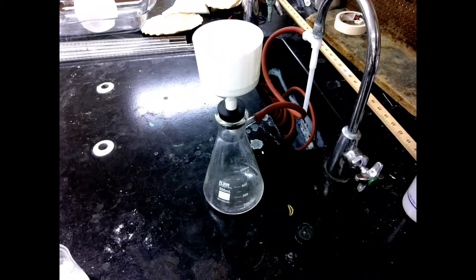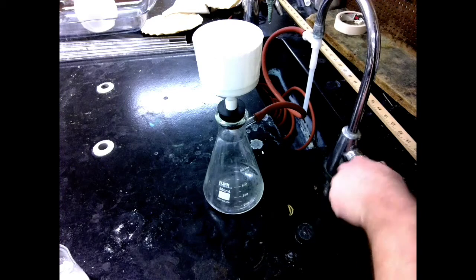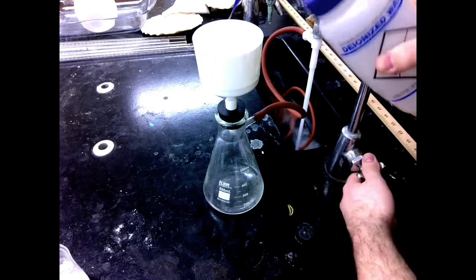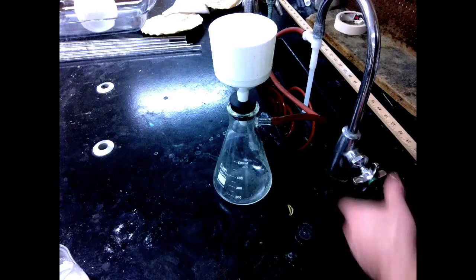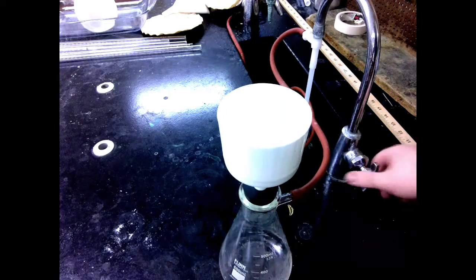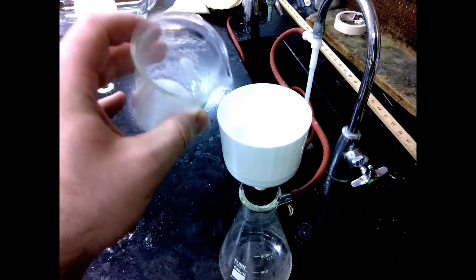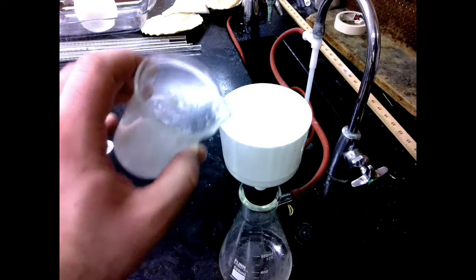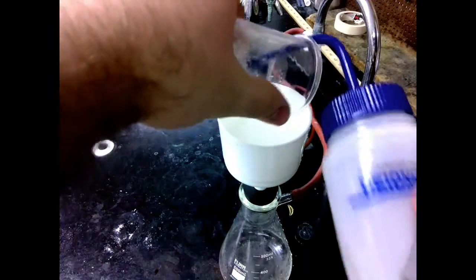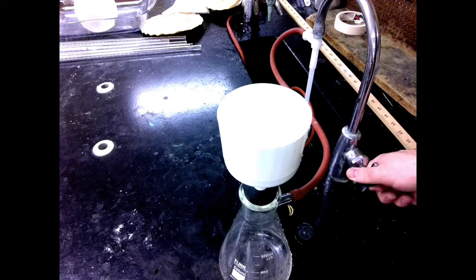Next, just like we did before, we're going to put our filter paper in our Buchner funnel, get everything ready. We're going to start our water. And then we're going to rinse it down a little bit. So now our filter should hold nice and tight, and we can pour the contents of our beaker through. We've got a little bit left in there, so we'll just use the wash bottle to get it out. So then we're just going to let this go until it all pulls through.